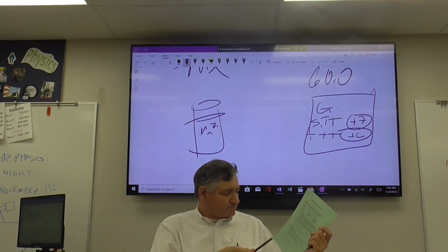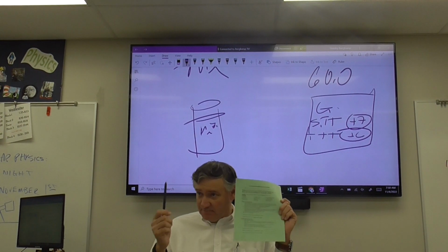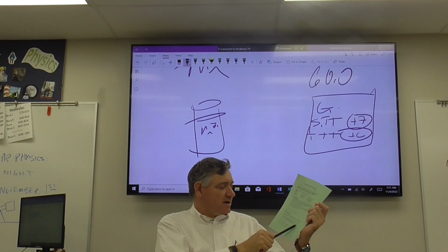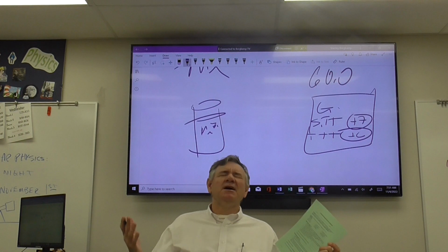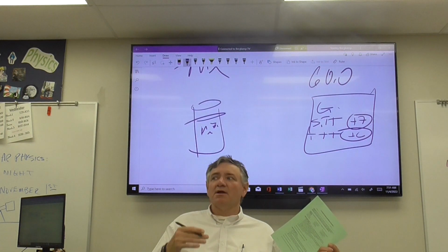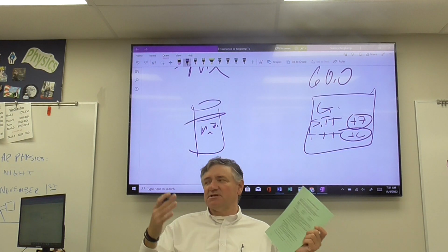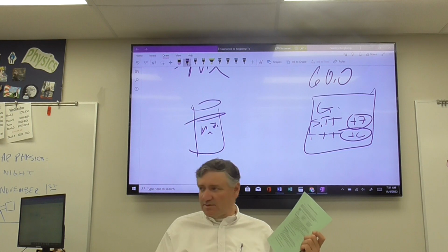So then you're going to add 0.01 molar sodium sulfite, Na2SO3, until a green color appears. This will take approximately 5 to 20 drops. Here's the problem. This is why I say there's such variance in this. Depending upon the size of the drops and the concentrations, this is the sketchiest one to get, the one that's going to be 6+.